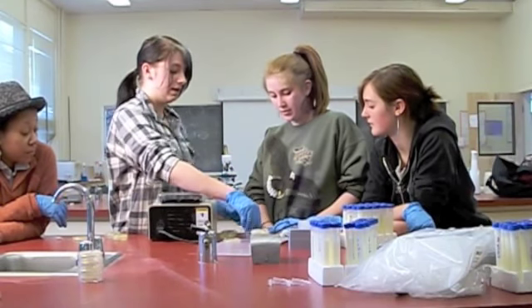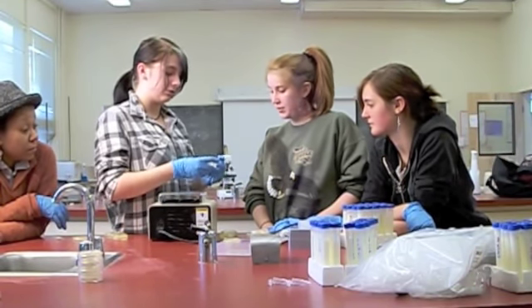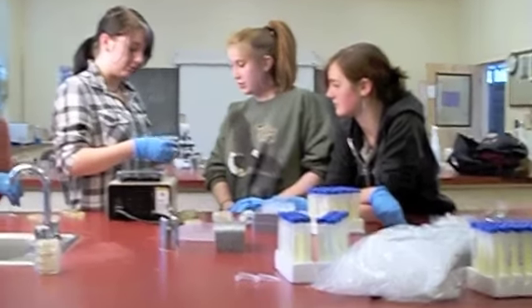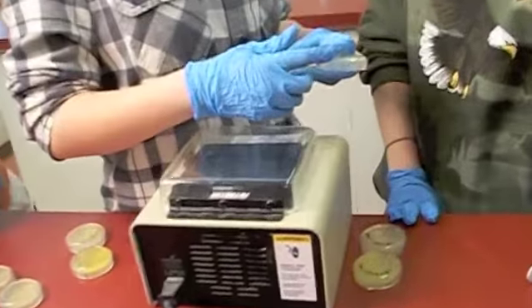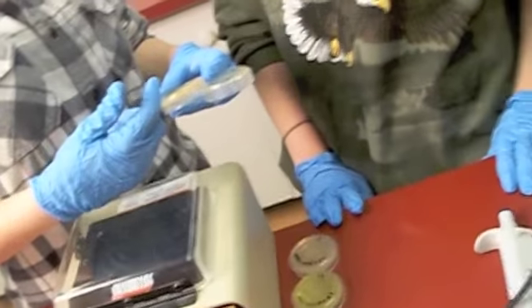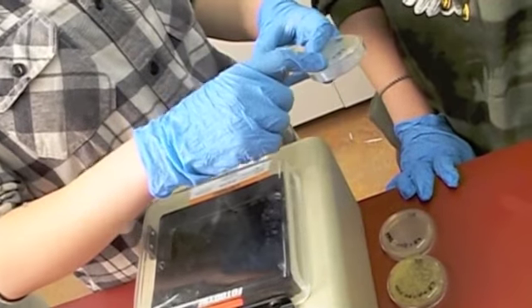It would be alive. This one doesn't have DNA, and the reason we did both of these, if they're both pretty much the same, is so that you could see whether the DNA was harmful or not, or whether it needed DNA to live. So if this one didn't grow, you would see that the DNA was harmful.